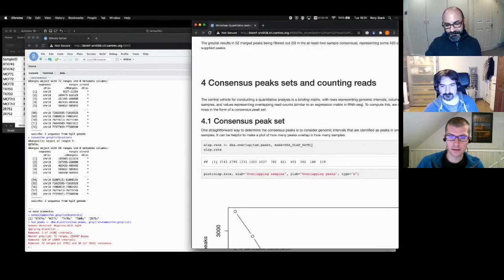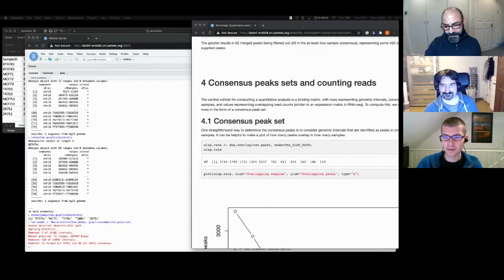There is actually a question now, Rory. Oh, I see Q&A, it just showed up. Are there tools for filtering? I probably need a little more detail of what type of filtering. Anna, if you want to tell me what type of filtering you're interested in, while you're doing that, I'll tell you what filtering there is. There's blacklist filtering, there's graylist filtering, there's filtering reads by quality, by duplicates. But I'm not sure if there's other filtering.